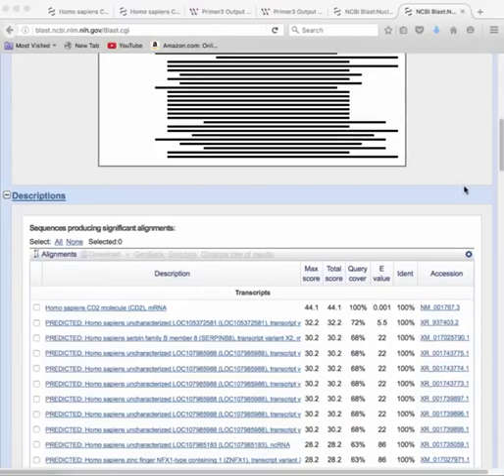So one easier approach is to order the primers, the left and right primers, more than one pair from your Primer3 software searches, and do a SYBR Green real-time PCR assay and check which set of your primers are amplifying better. Out of that you can choose the right primer set and then order an appropriate probe that you have already designed. Then you can order that with the FAM and the TAMRA or FAM and MGB combination and use it. So that is the way to design your primers and probes online. So thank you very much.